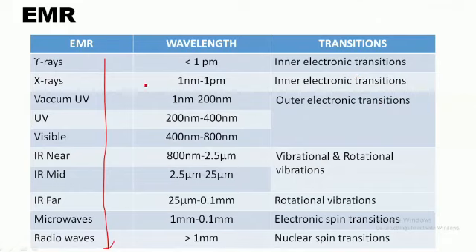To proceed further, we will go directly into UV spectroscopy, where we will have to see a few rules and regulations which guide it.